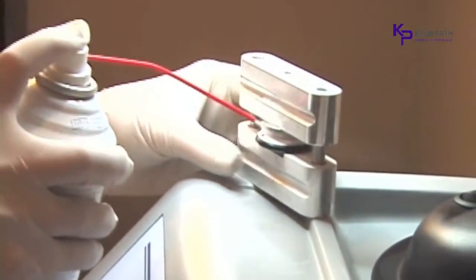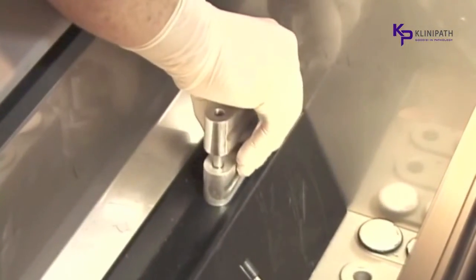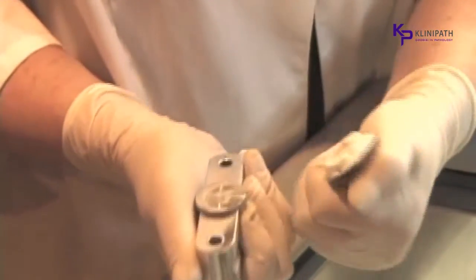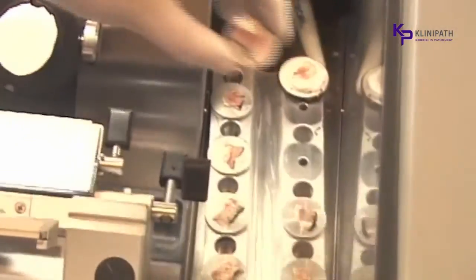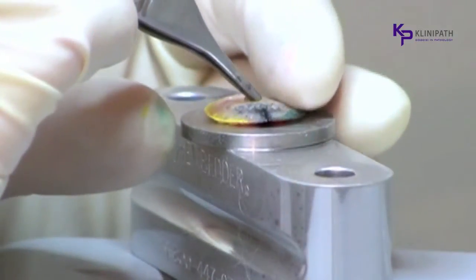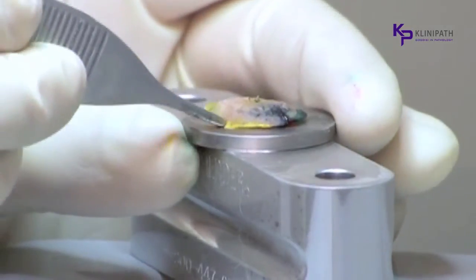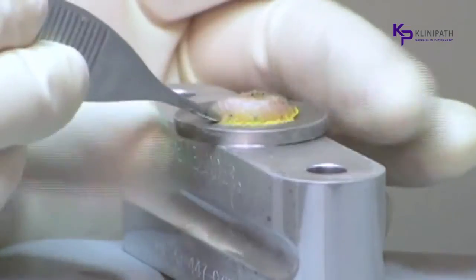The Cryoembedder system is easy, fast, efficient, accurate, cost-effective, and durable. It has been proven in labs and offices across this country and around the world to be a valuable instrument in the processing of tissue for frozen sections. Simply said, it works.